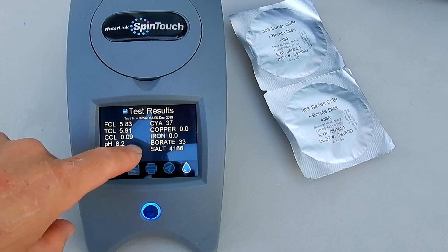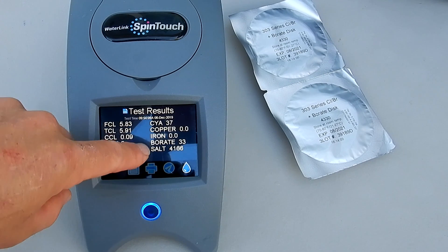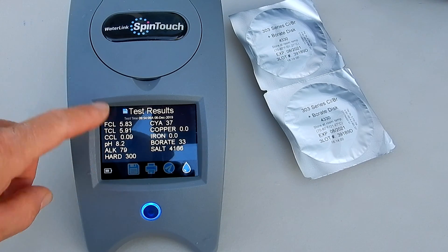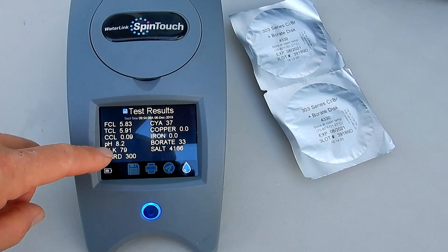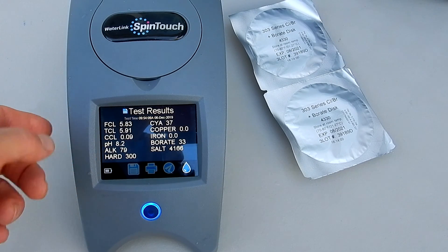You can see that the borate level here is at 33 parts per million, but the most important thing is that these discs will record the borate level of the pool accurately. So you can add the borates to the pool to bring it to 30 to 50 parts per million to maximize the benefits of having a borate pool.